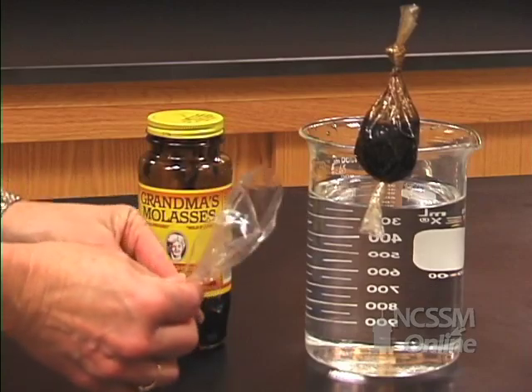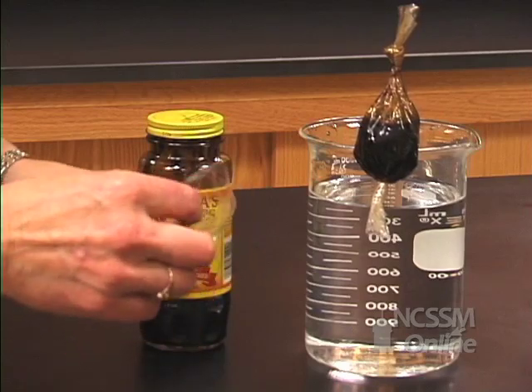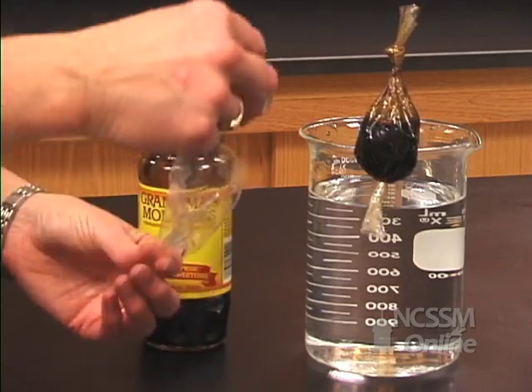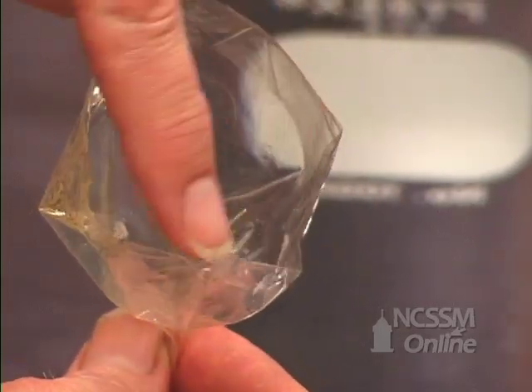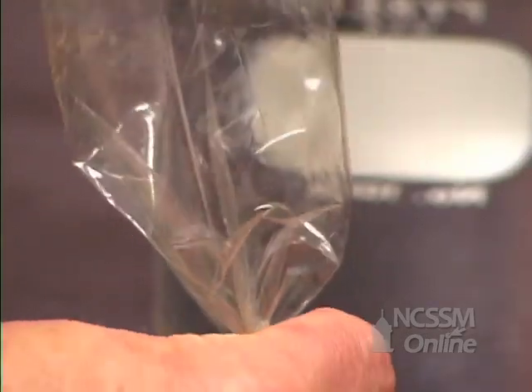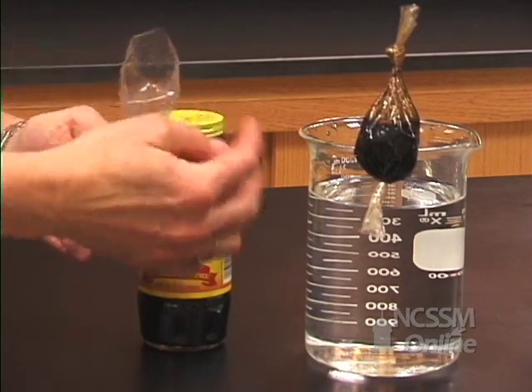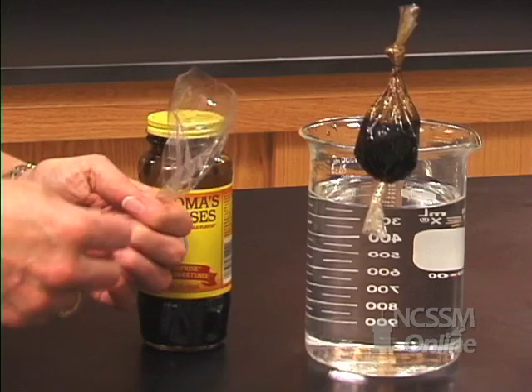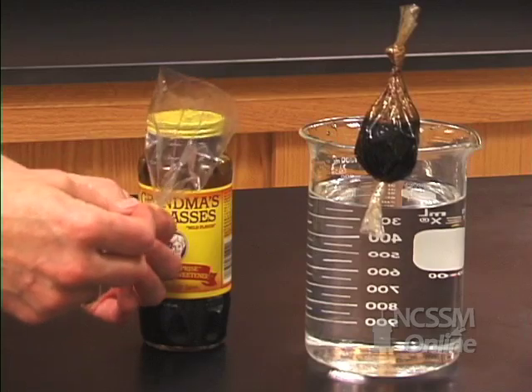This is dialysis tubing. Dialysis tubing is a membrane that if we put a compound inside, like water or molasses, if the molecules are very large, they can't pass through the little tiny holes in the membrane. But if they're very small, they'll pass through. That's why it's called semi-permeable — little things will pass through, but not big things.